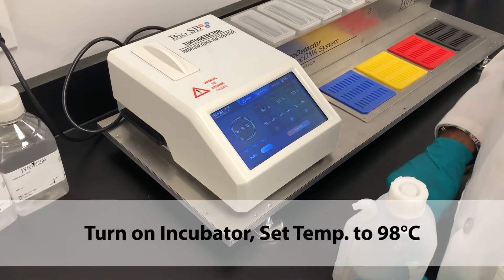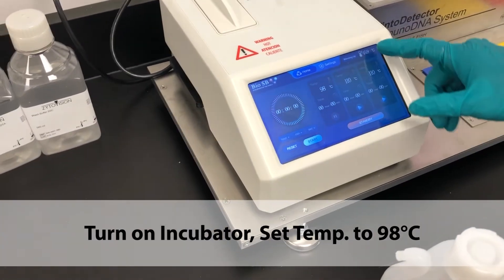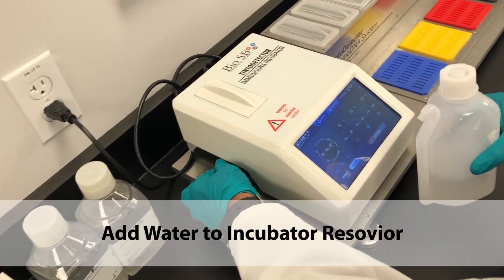The first step in operating the Tinto Detector for Sish protocols is turning on the incubator and setting the temperature to 98 degrees Celsius. While the incubator is heating up, be sure the reservoir contains water.